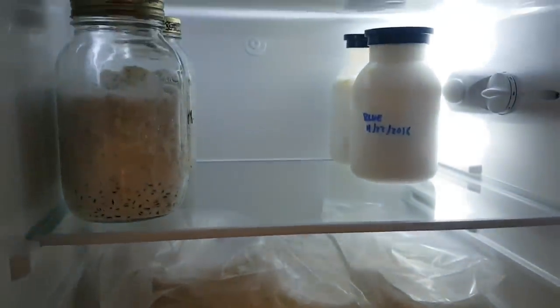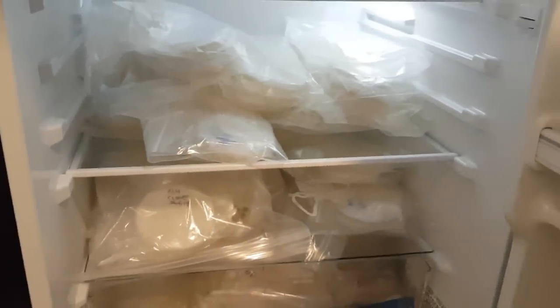If you're dealing with a lot of agar dishes and liquid cultures, consider getting a mini fridge just for the lab. If you store cultures in your main home fridge, it doesn't take long before all your drawers are filled up, and other food items could contaminate your plates. Having a dedicated lab fridge lets you store lots of cultures ready for use anytime. Of course, if you're not storing cultures long-term or don't need much space, you can keep them in your regular fridge or on a cool shelf.